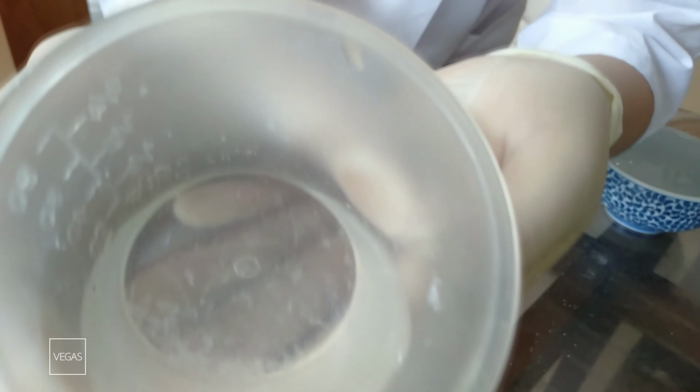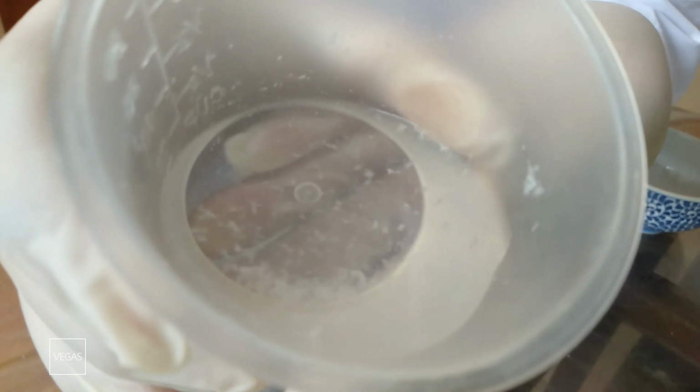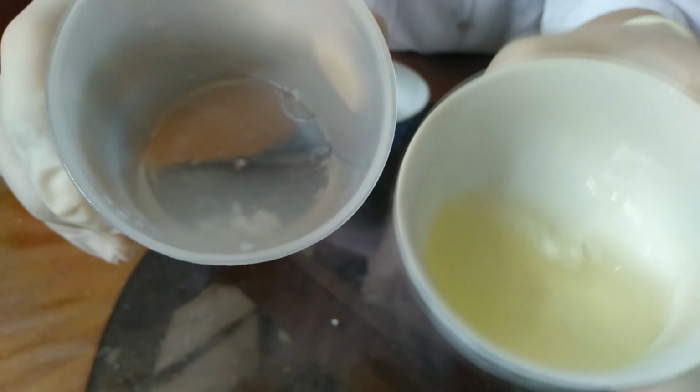Adding acid deforms the protein and form bonds with other proteins, causing them to coagulate. As compared to the normal one, this one formed feathery strands of whites.